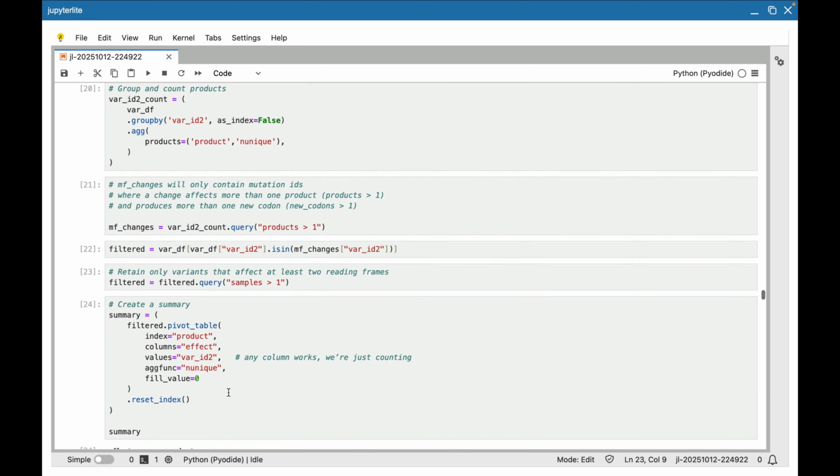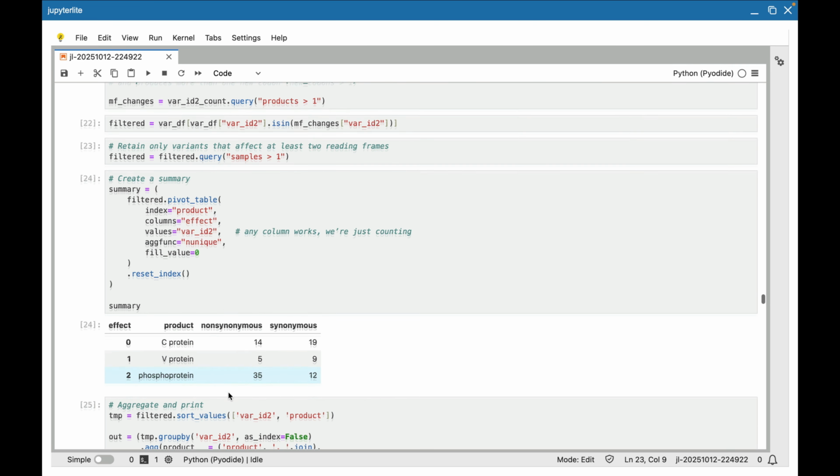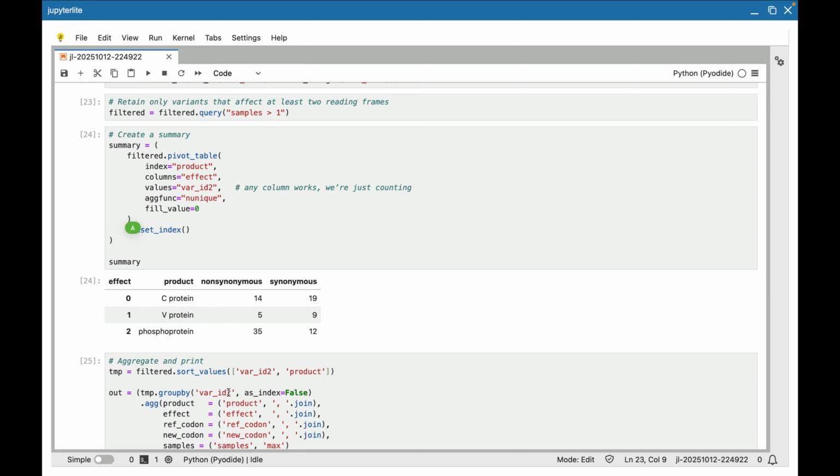So the next step is we wanted to see the balance, because the unusual situation about this whole arrangement is that a single change has multiple effects because it affects two reading frames. What reading frame is leading, in the sense that it accumulates more non-synonymous substitutions, and which reading frame is lagging, with fewer non-synonymous ones?